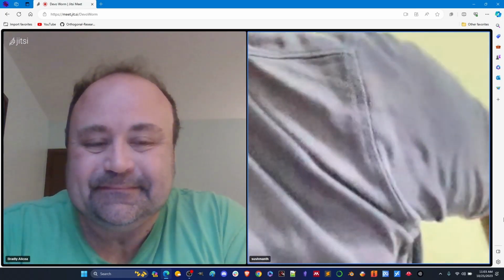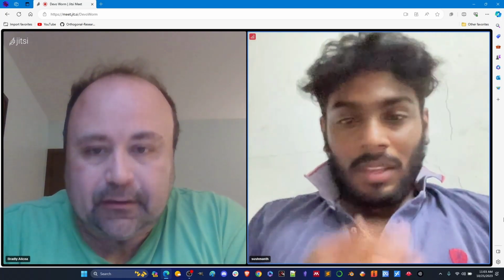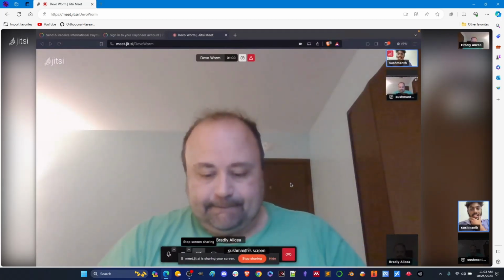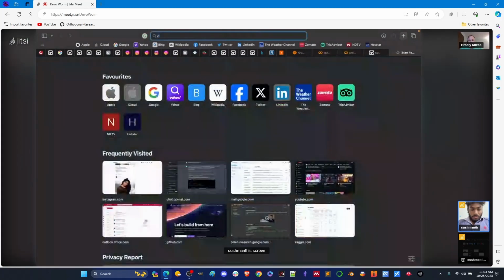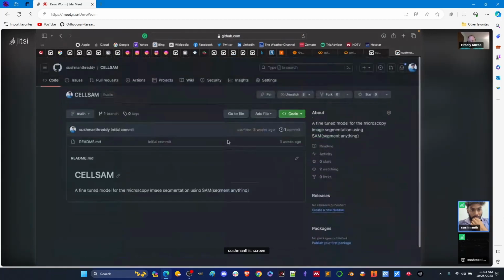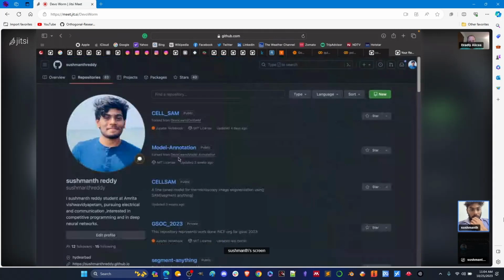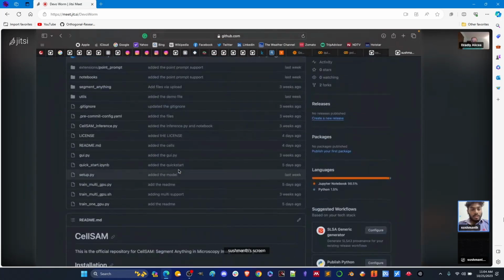I just want to show you the demo of how the thing works in CellSAM. In last week's meeting, I was outside, so I couldn't show you the complete project in a clear way. So, Bradley, let's open my report. I will start with where I started this whole project.